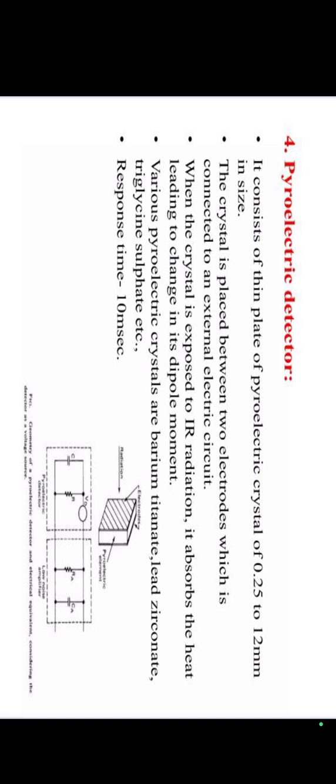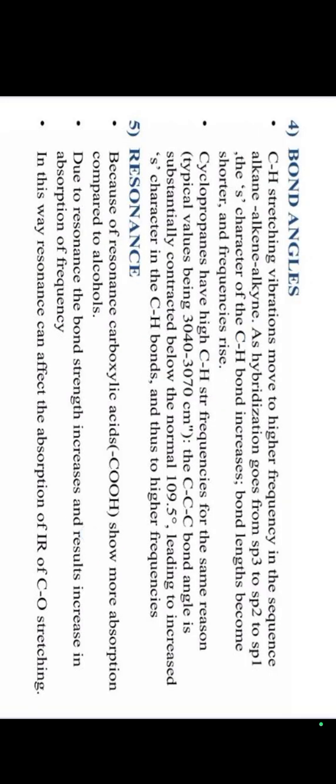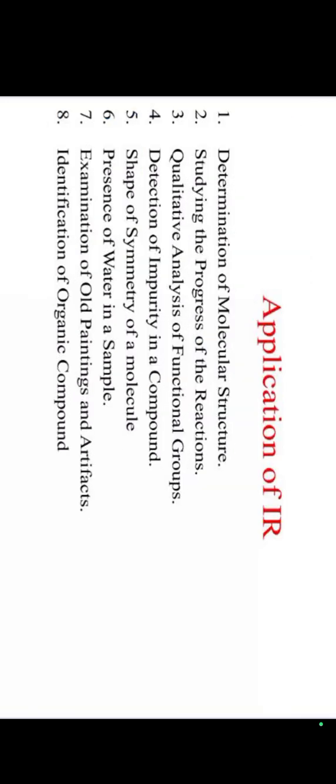Next we see the applications of the infrared radiation spectrophotometer. First application is determination of molecular structure. To determine the molecular structure we use the IR spectrophotometer. It is the main application of the IR spectrophotometer, and we use it to determine the functional groups. We determine the functional group of a certain compound. Second one, studying the progress of the reaction.